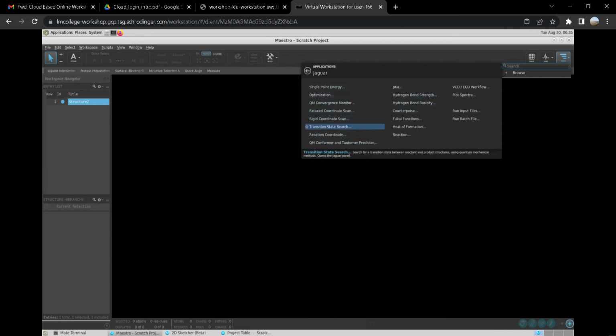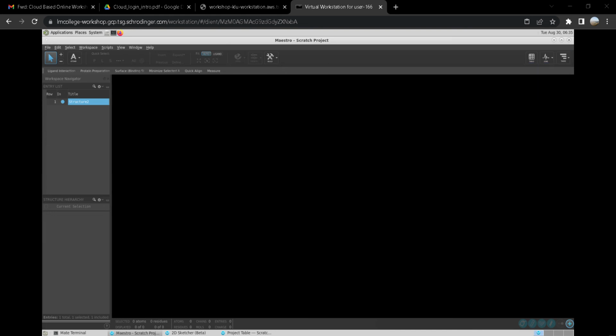Hello, sir. Good morning. Anybody else? Yes, sir, very good morning. Sir, is it possible to get the structures in SMILES format from the internet and drag it into the software? Absolutely, very easy peasy. You just have to copy and paste it. It has a pasting option.